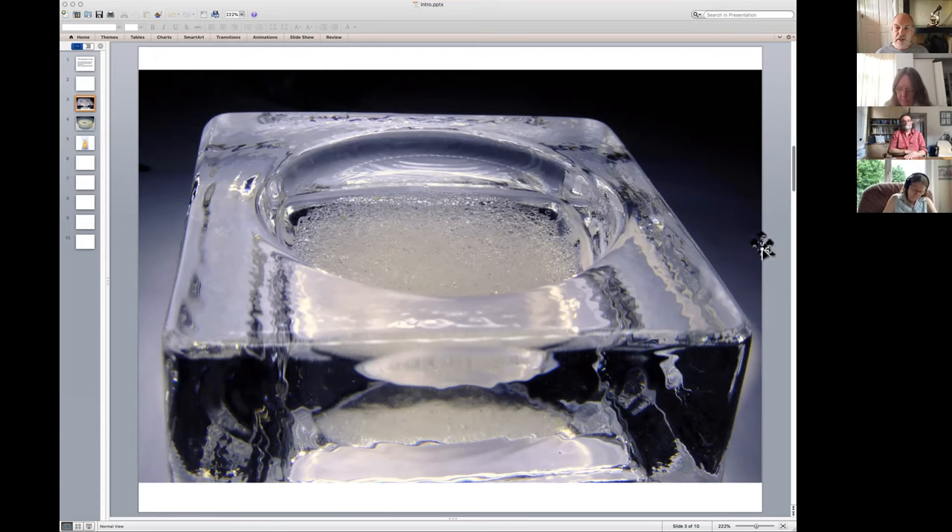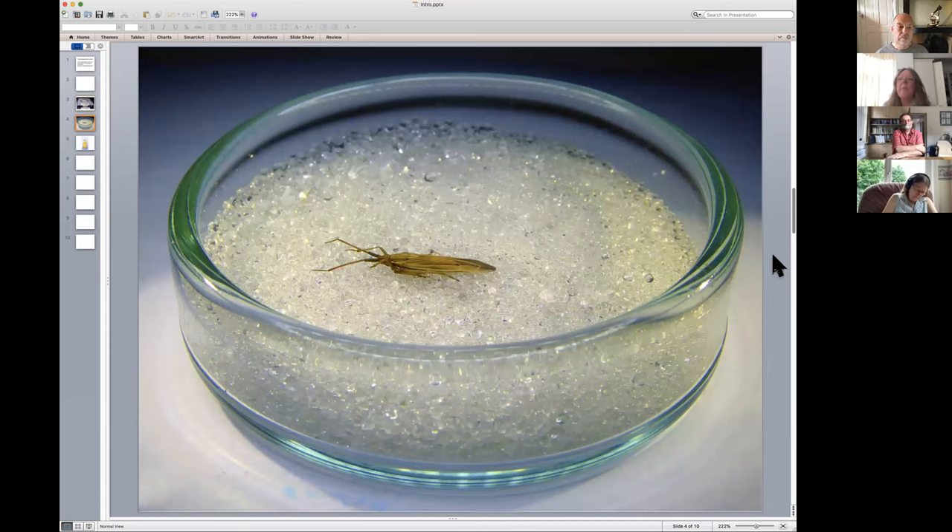For harder-bodied things I tend to store dry. When it comes to things like bugs — this is one of the elongated grass bugs, Stenodema — same thing: a five-centimetre petri dish, a layer of glass beads, no alcohol now, just the dried specimen. You can flip the specimen over and the glass beads hold the specimen at the perfect angle for photography, focus stacking, or just viewing under the microscope.